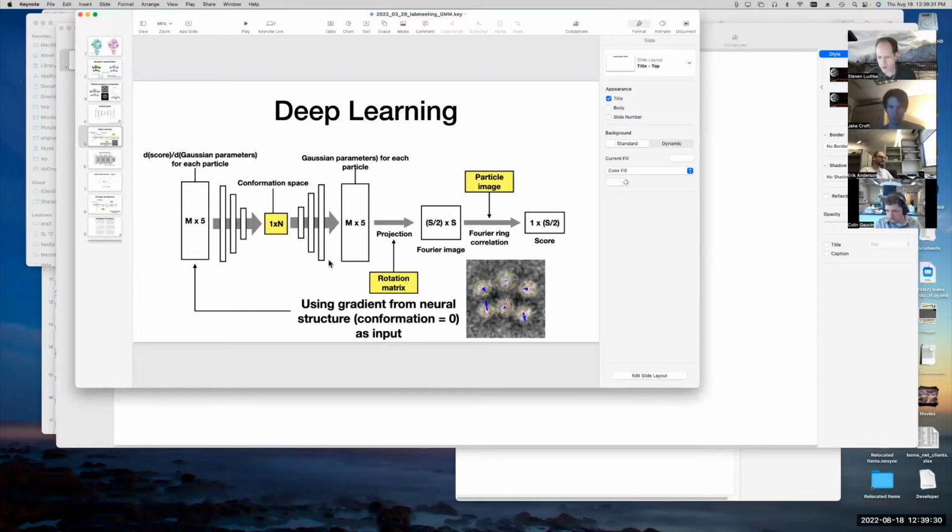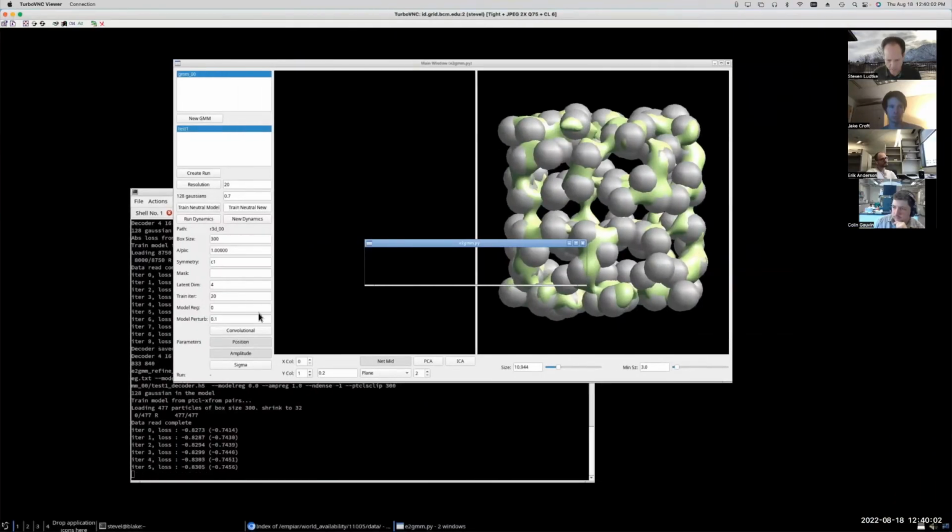Right now what we're doing is we're pre-training the network using just the single 3D map as a starting point. So we're mostly training this part of the map. If you put 0 in, what you get out is the neutral model. So 0 is the neutral configuration. If nothing's moving, then it's going to be in the neutral configuration. And those numbers that we get out from -1 to 1 are going to be changes in the 3D map with respect to that neutral model. So right now it's just training the neutral model part of the network, and that's pretty fast. It's almost done now.